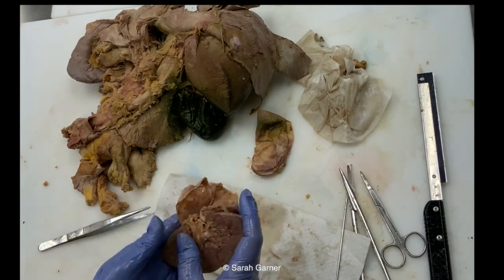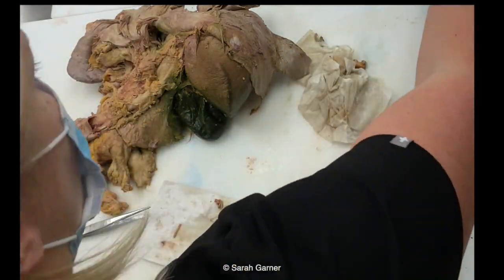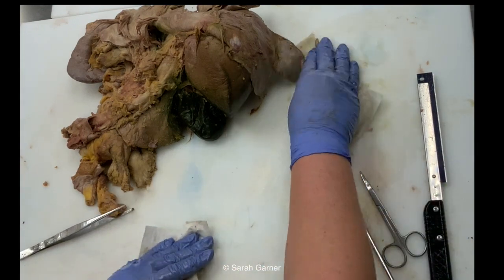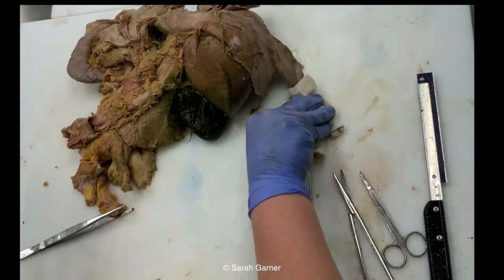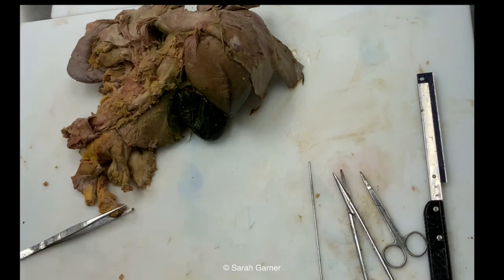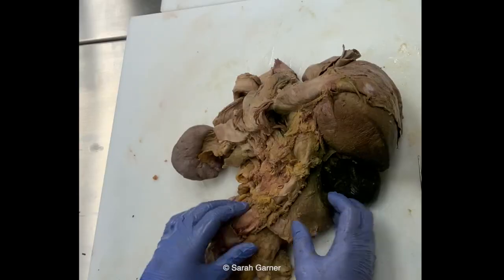So thoroughly inspect. Good to go. Okay, so that was adrenals and kidneys. Now, what's next? Like I said, in my opinion, the order in the abdomen isn't really that important. It just kind of depends on the case and the anatomy and what's going on. So as long as you're doing everything you need to do, it should be okay.